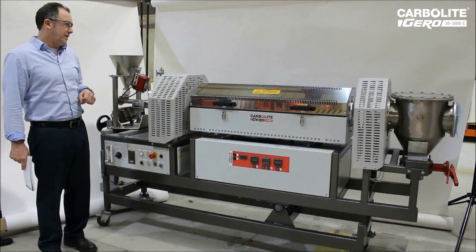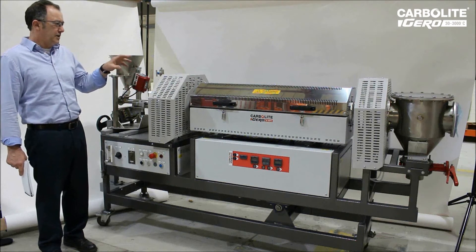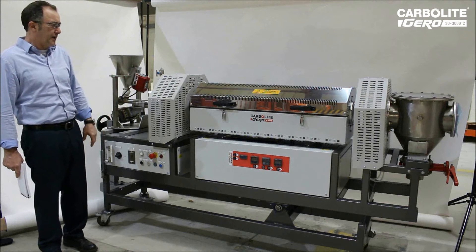This is the Carbolite rotating tube furnace based on the HZS split tube 3 zone furnace.